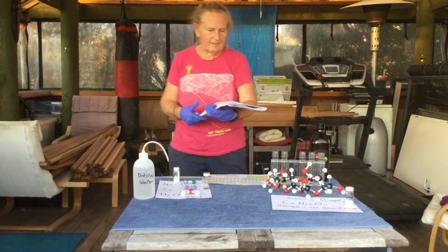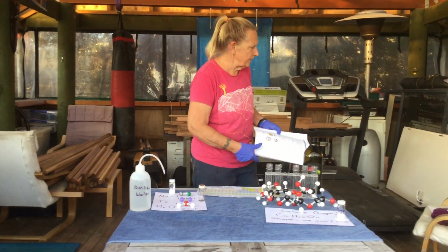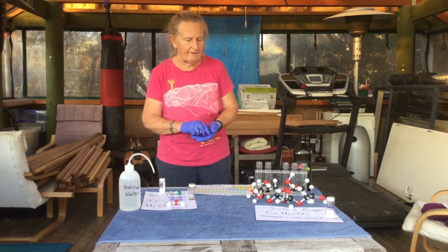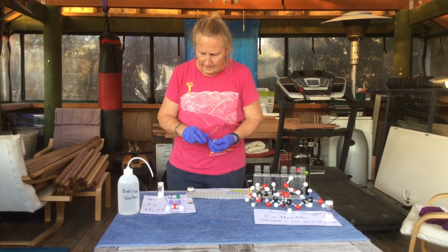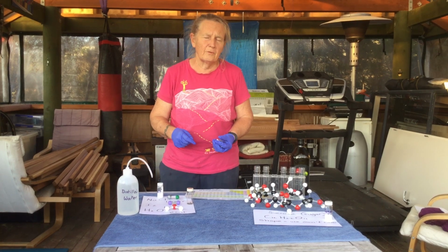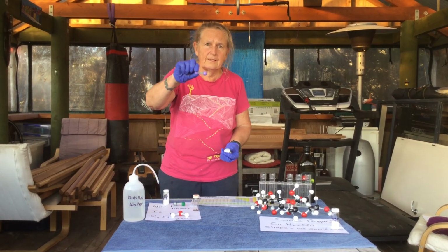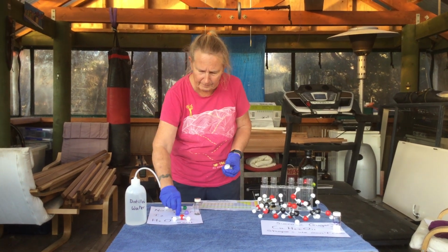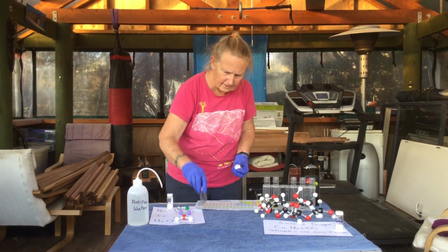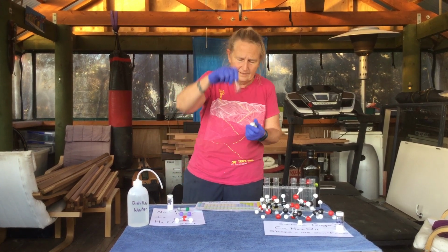Okay, hi, we're ready for Solubility 2, that's Prac 5, and I'm doing this because I'm guessing that you don't have iodine at home. Iodine is the stuff that those old enough to remember, the nasty lady in the playground would paint on cuts and scrapes, but now it's considered too dangerous for that kind of carry on. So here it is, and hence the gloves.